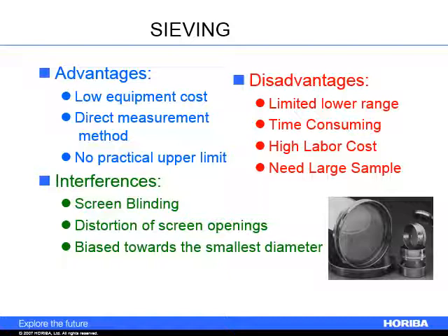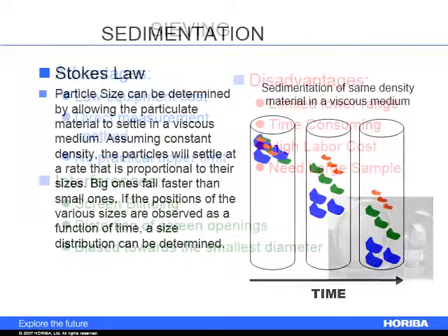Even converting this into the other particle size data can be a challenge, but most of the particle size systems today have sort of an automated math that it'll do. So I can convert my particle size data to sieve and sieve data into representative particle size data. Sieving is clearly done by mass, so it's related somewhat to volume if you know enough about your material. So that's how you can do that kind of conversion, because laser diffraction data is done by volume.